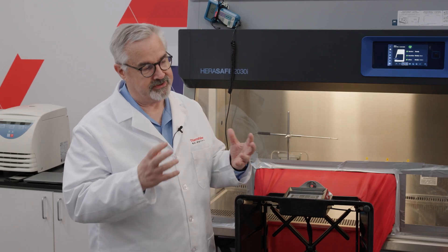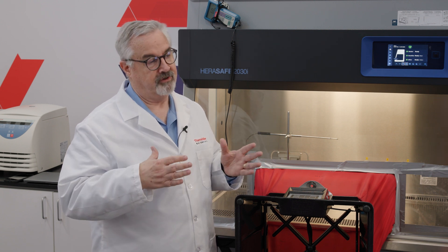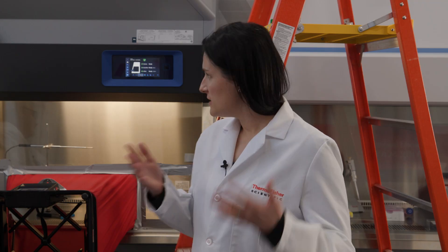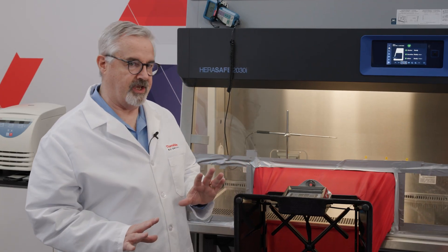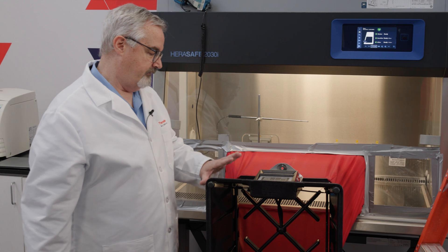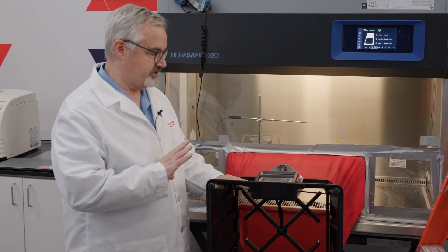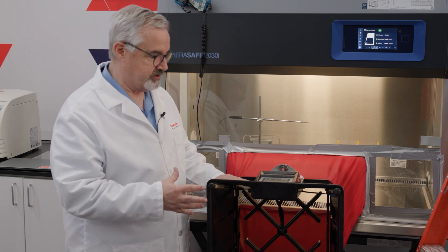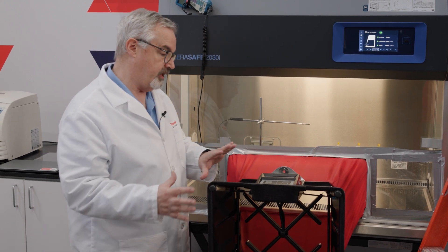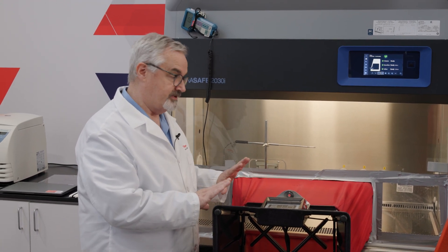Smart Flow Plus has the ability to independently compensate both inflow and downflow separately. For the demonstration, there are three components. First, I have a DIM — Direct Inflow Measuring Device — the same sort of device used in the annual field certification. It will measure the inward flow in CFM of the cabinet, the inflow.